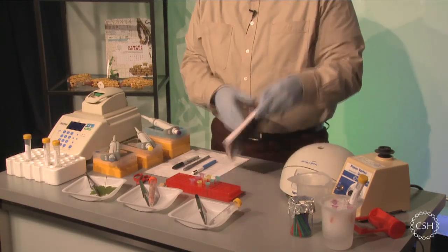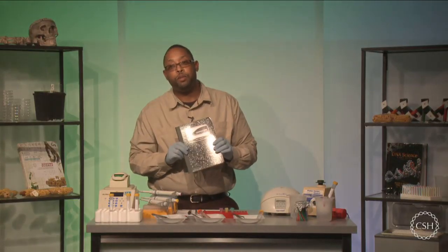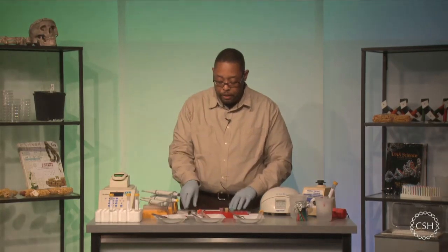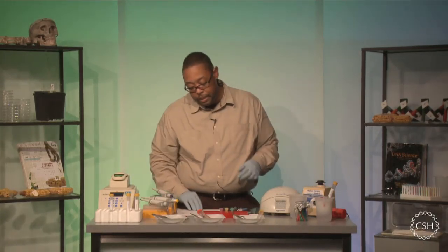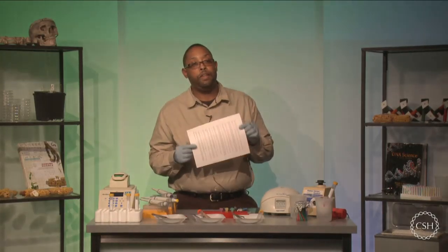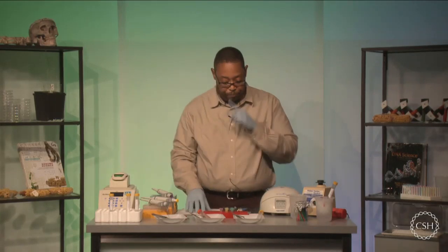One of the things I will promote is that you've got to have a notebook around. You've got to be able to jot down notes about your material, so please have your notebook nearby so that you can keep notes of everything that's happening. You're obviously going to need something to write with, so you should have a pen around and a marker. This will allow you to label your samples. And then you should have your protocol available to you with any notes that you need on that as well. So please make sure you have all these things physically around with you.